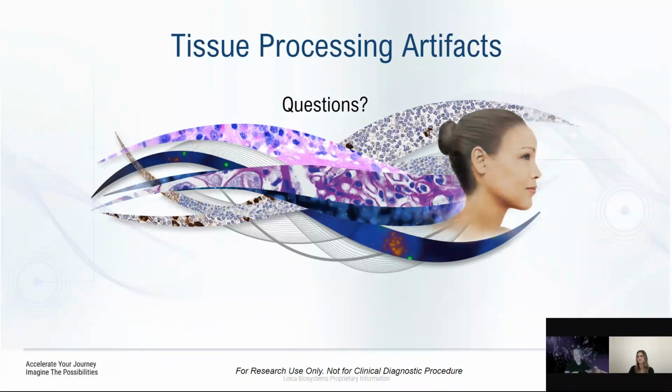Historically, we made it up in the laboratory, so you always want to do formaldehyde and dilute it down, make your 10%, add your phosphate buffers. You make sure that you pH it. If you're in the lab and you're making it, I believe the pH is supposed to be around 7.2. Most labs nowadays just buy it commercially, but we have seen that it's made in bulk and sold in bulk.